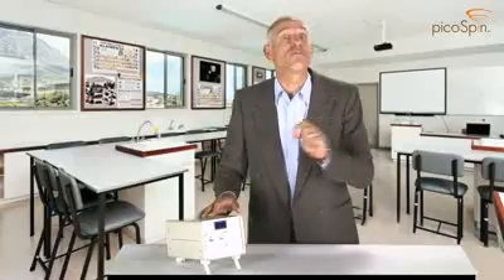Hi, I'm Matthew Taylor, here to tell you about our new miniature 45MHz NMR spectrometer, the PicoSpin45. This revolutionary product does for NMR what the PC did for computing.